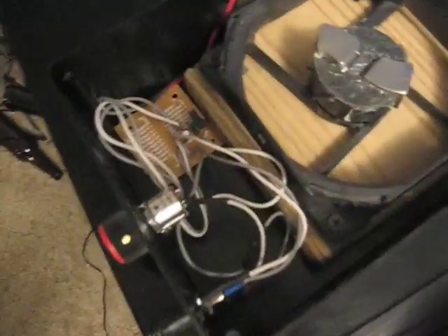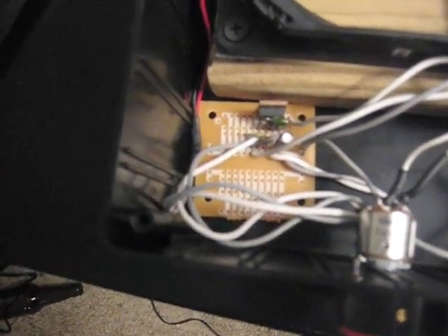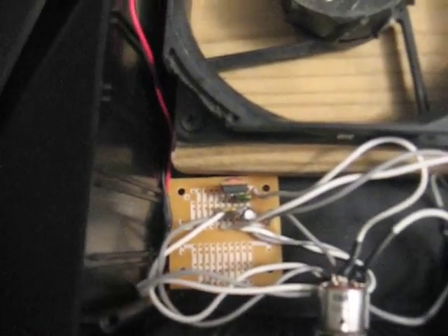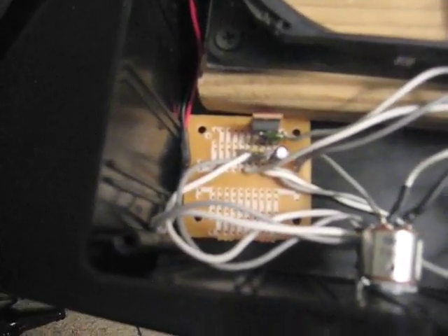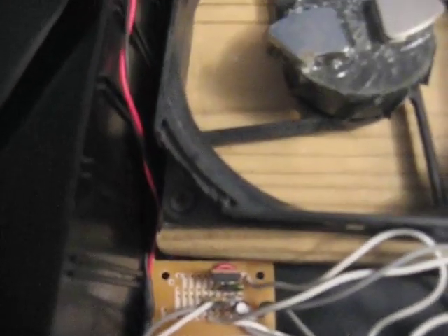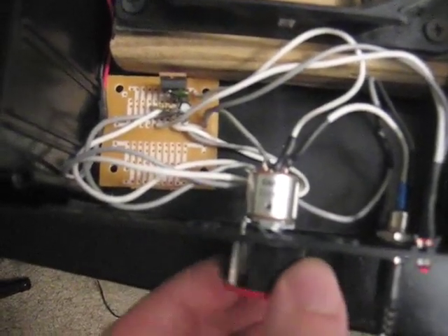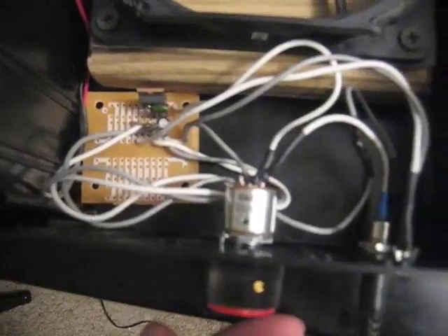Here's what's inside. On the left we have a very simple power circuit that uses a variable voltage converter to convert whatever the input voltage is to the output voltage of the fan. The voltage is adjusted using this 10K pot, which also has a power switch on the back for the power running into it.